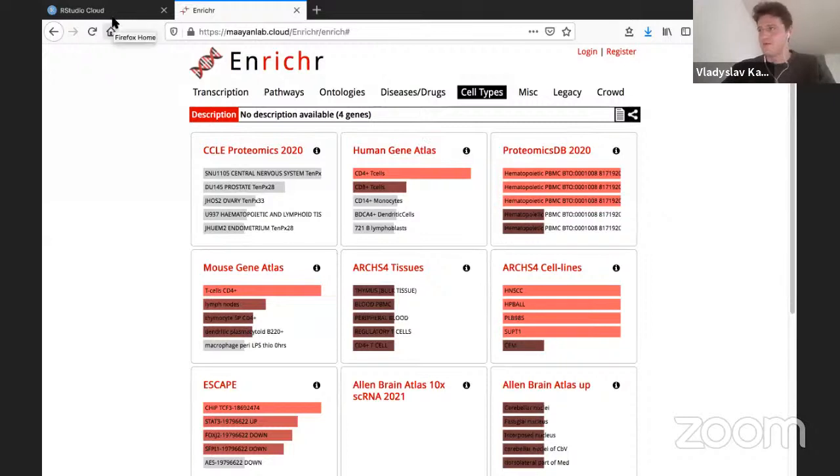It will not work every time, because when you're getting too deep inside your data, when you're subclustering a lot of immunological cells, it will not help you. But for general cases, like for example to identify B cells or plasma cells, or even dendritic cells or plasmacytoid dendritic cells, it will help you. It's really a great tool to see which cell population you have.